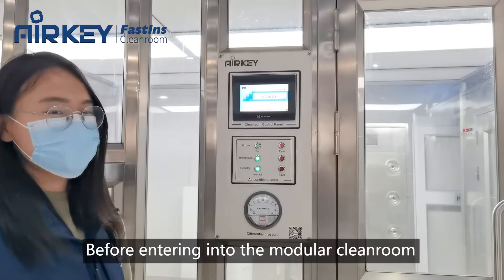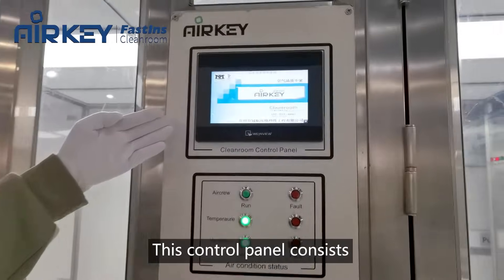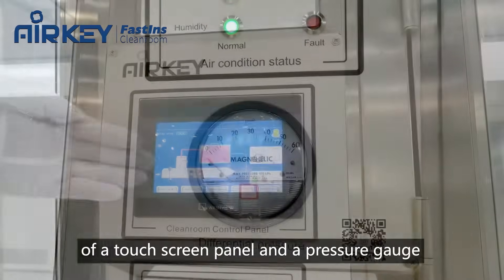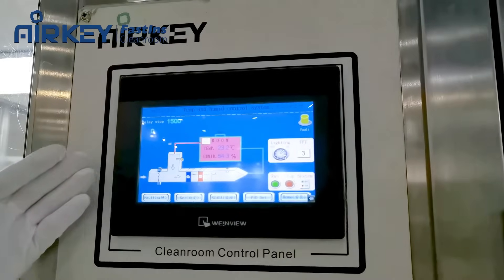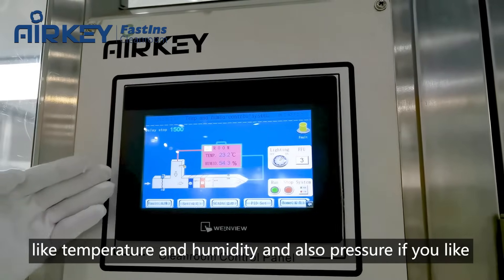Before entering the modular clean room, let's operate the control panel here. This control panel consists of a touchscreen panel and a pressure gauge. From this control panel, we can set the parameters of the modular clean room, like temperature and humidity, and also pressure if you like.